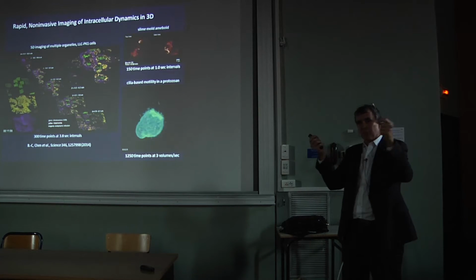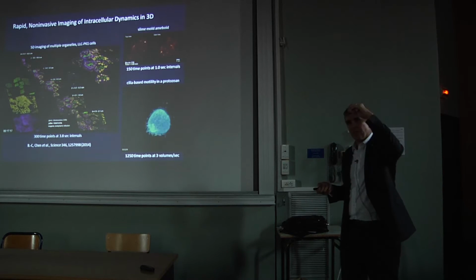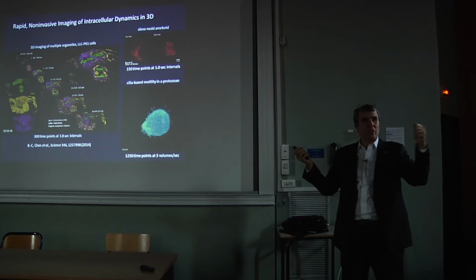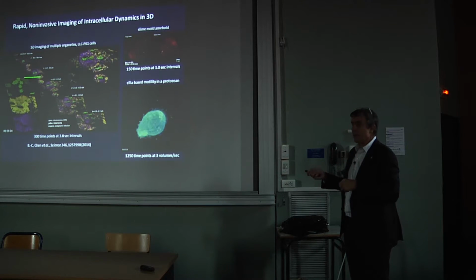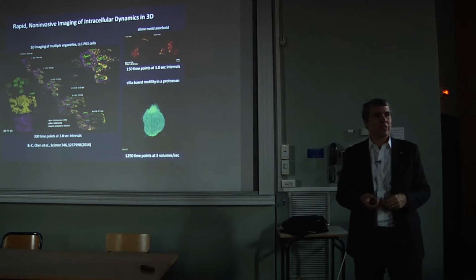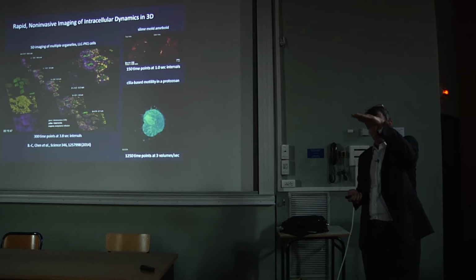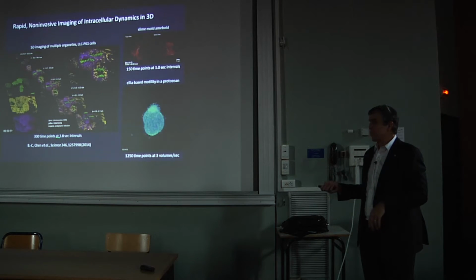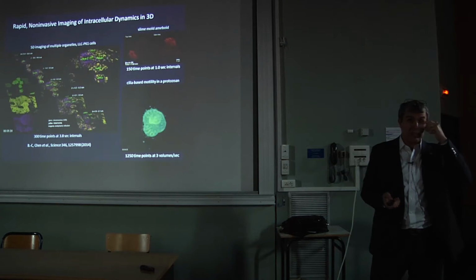The mitochondria, which are normally long sausages, fragment into pieces, and those pieces fit right inside of those pockets and they're carried along as the cell divides. So this represents 300 time points in each of 3 colors, so 900 3D volumes. Each volume consists of hundreds of planes, so it represents over 250,000 images taken from a single set of cells.